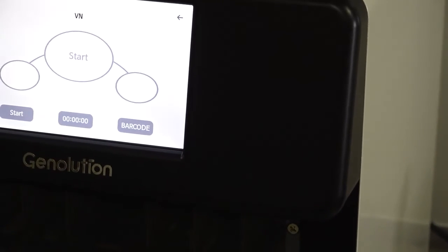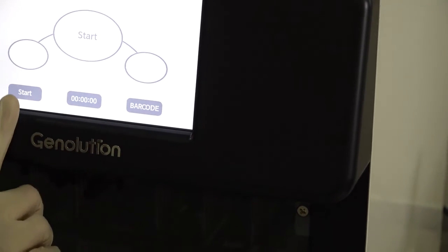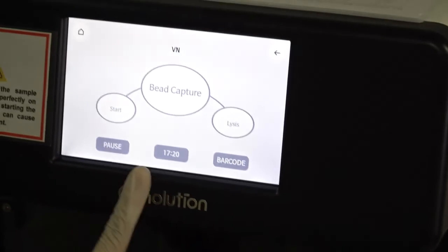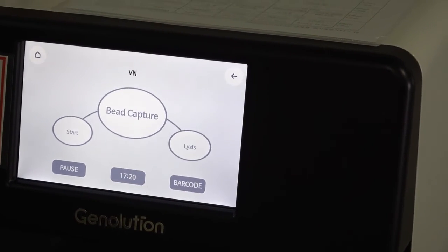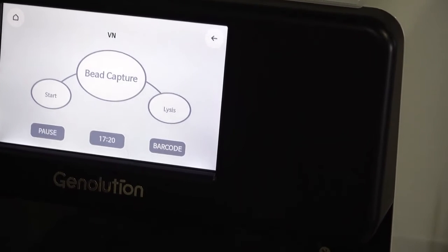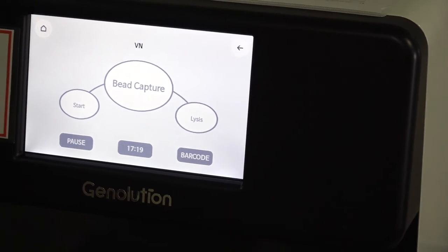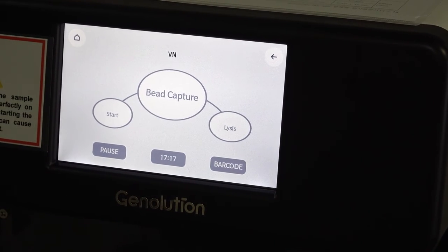You click SET and the instrument will start. Now, this instrument will take approximately 17 minutes to complete the entire procedure from loading the sample to extraction. And then we click on start and the procedure will basically cycle through with the machine.